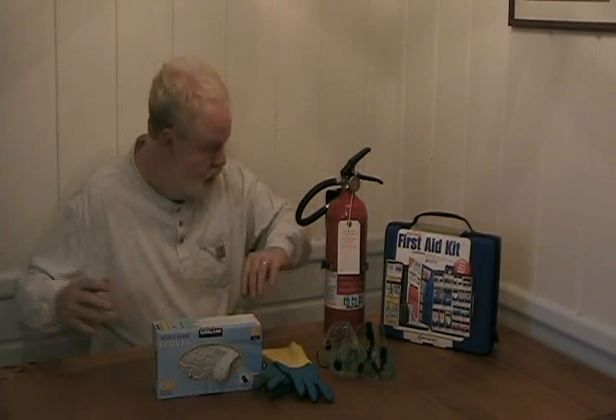The third aspect of PPE is protective clothing. Right now I'm wearing an ordinary long sleeve shirt. It is 100% cotton — actually I think it's 99% cotton, 1% polyester — but that aspect of it is very important because cotton does not take flame easily. It does not react with most chemicals easily, so it provides a protective layer for your skin. Make sure whatever you do not to wear polyester items or any other sort of artificial fiber items in the lab. They can melt, they can burn, they don't provide a lot of protection, and they react with a lot of common laboratory chemicals. So wear pure cotton.